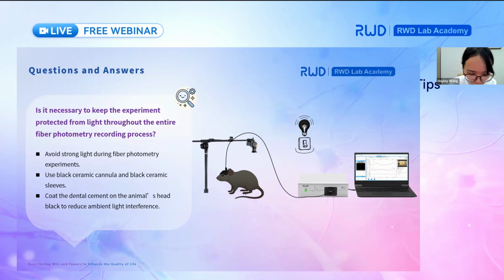What is the typical recommended range of raw fluorescent signals, baseline level during recording? If a signal appears too low or noisy, which parameters would you recommend adjusting first among LED, gain, frame rate, exposure time? Do you have a preferred order or strategy to optimize these parameters?